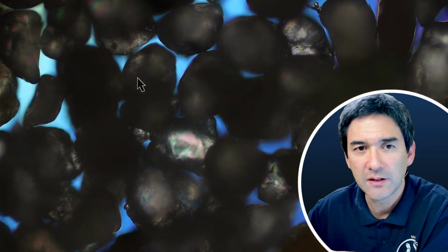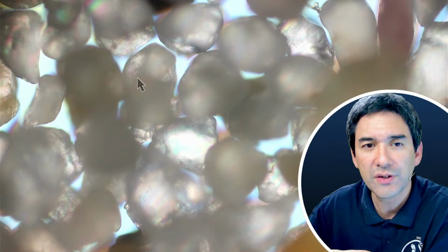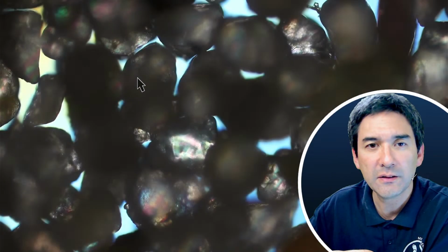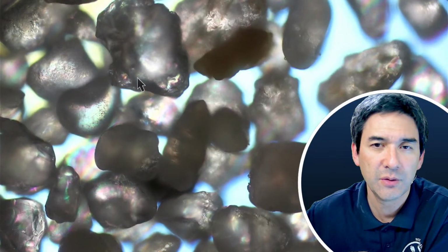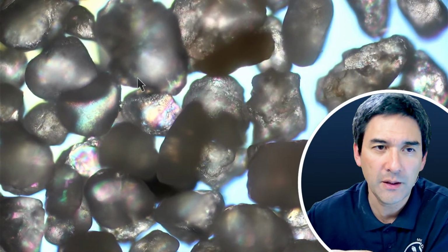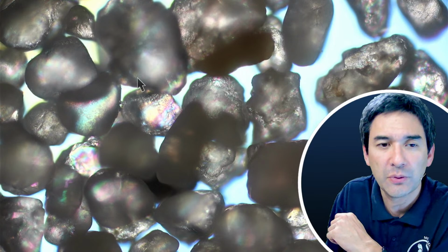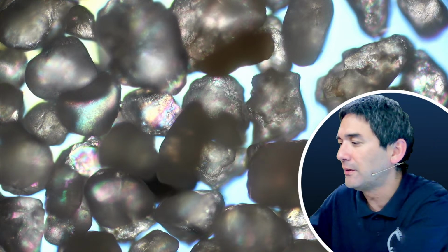Let's just go up a little bit here. Now I turn on DIC, and you see immediately that, of course, the depth of field is quite low. Essentially, those sand grains are quite large and quite thick, and therefore it's not possible to get them all into focus. Let me turn the arrow off again. Okay, so that's a little bit the thing here. Now you know one possible suggestion how to make those slides.